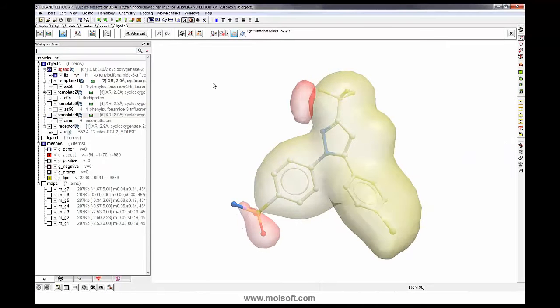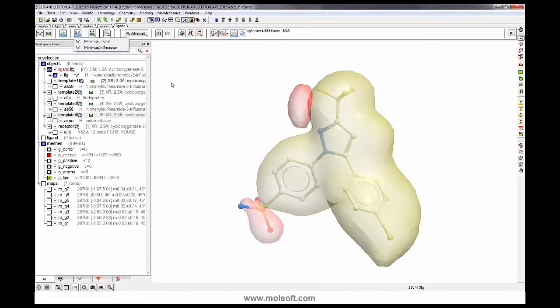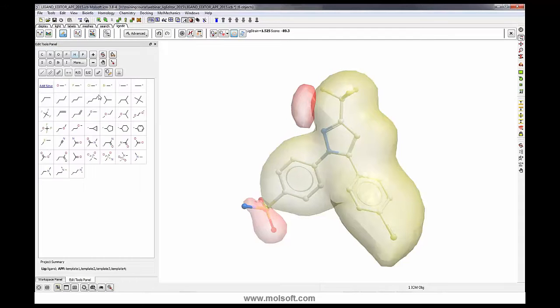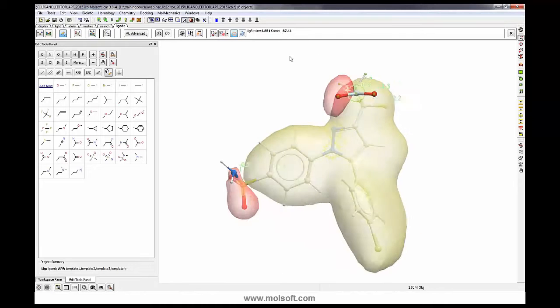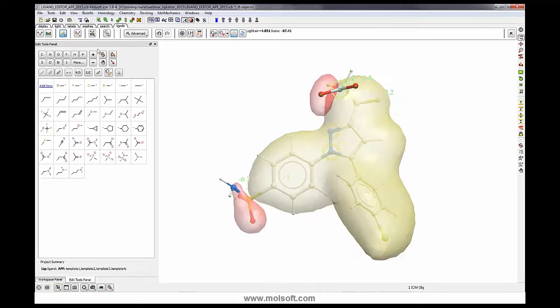We evaluate the score. We can minimize the ligand in the field, so that improves the strain in the score. So we have 2 buttons, minimize button and docking. It minimizes a shorter thing. So we can add a group here and evaluate the score. So in the same way we had these energy circles. It doesn't quite like that one. The score got a little bit worse, but it's a reasonable modification. You can undo it if you don't like it as before in the same way.